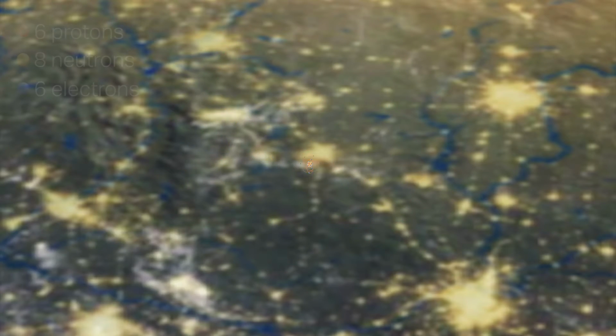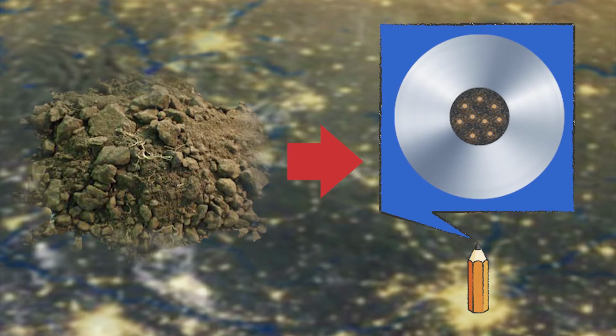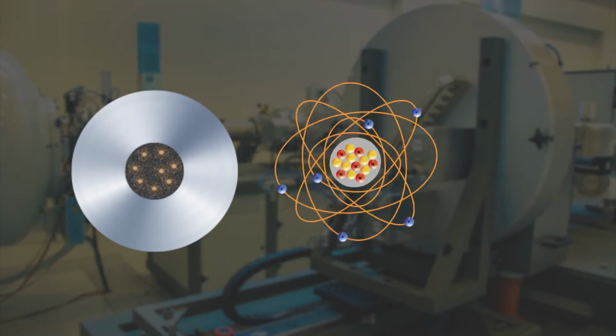So what we do is we take any sample, we convert it to graphite. There's a little aluminum button with the graphite in the center of it, and we can mount up to 200 of these graphite targets into a cartridge type, we call an ion source. Because what we're going to do is take the atoms of carbon in that graphite and convert them to ions. We're going to ionize them.